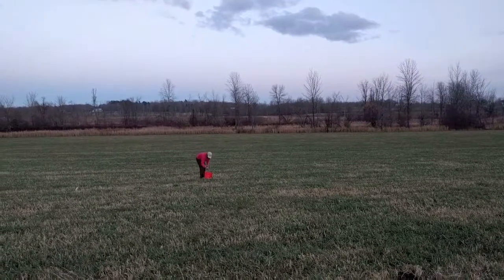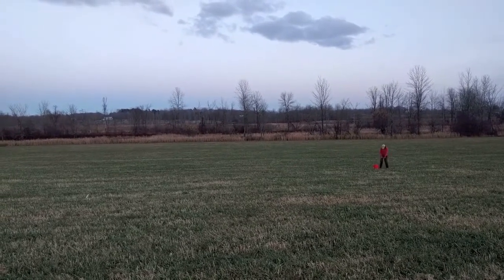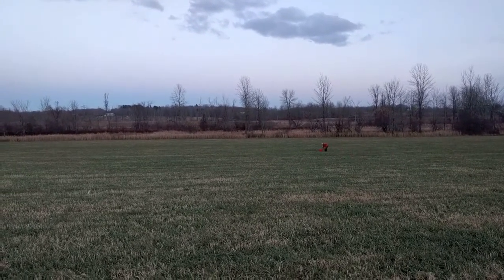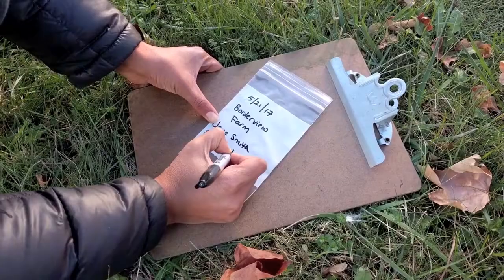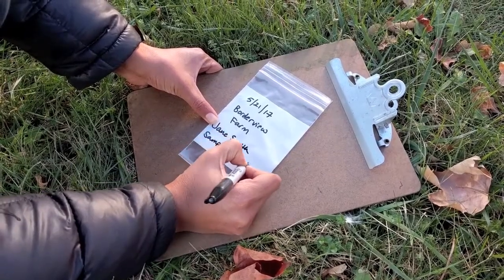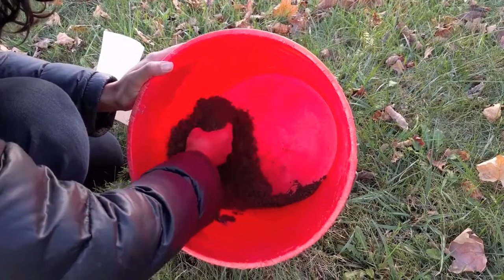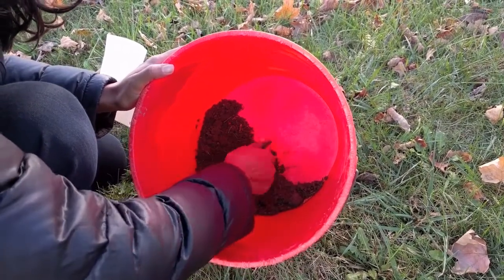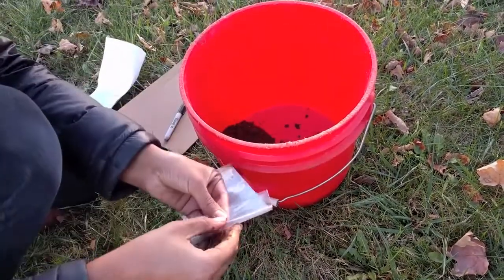Take 10 of these cores per acre of field. Take the cores in a zigzag random pattern to get accurate representation of the sampled area. Get your bag ready by writing down the date, your name, and the name of your sample, which may be the field name. Once you have taken all of your soil cores, mix them together and break up big clods. Take about one cup of soil and put it in the bag.